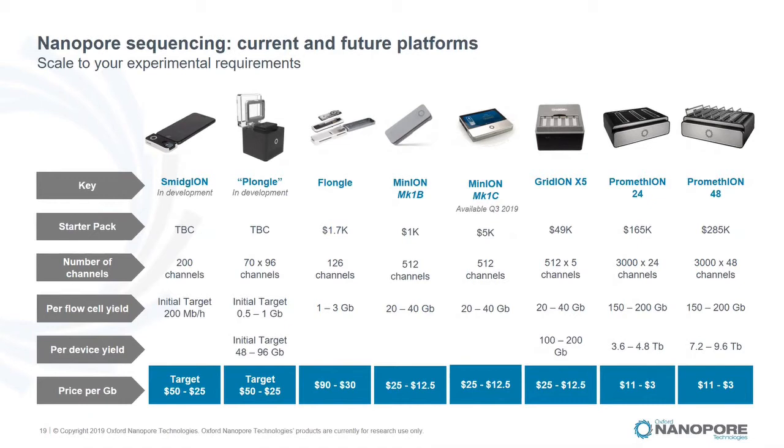But the other day, I met a very interesting customer. He got a very unfortunate Flongle, but he was very excited. He said, I got a very good result. For a Flongle, we expect 126 channels and 126 nanopores embedded. But very unfortunately, he only got 7 nanopores, and he was very disappointed. But he was just targeting one gene. It was a patient-related one, and he really wanted to know the transcript difference from a healthy child, and he sequenced. Those 7 nanopores generated 20,000 reads. That was good enough to classify the isoform difference, and he could tell how much of the same transcript came from the healthy child and how much was patient-specific transcript from those 7 nanopores.